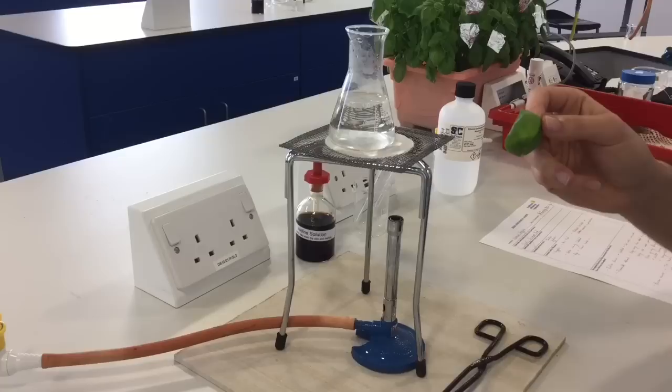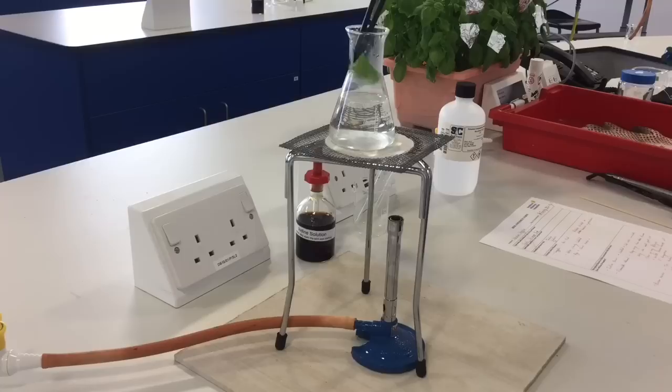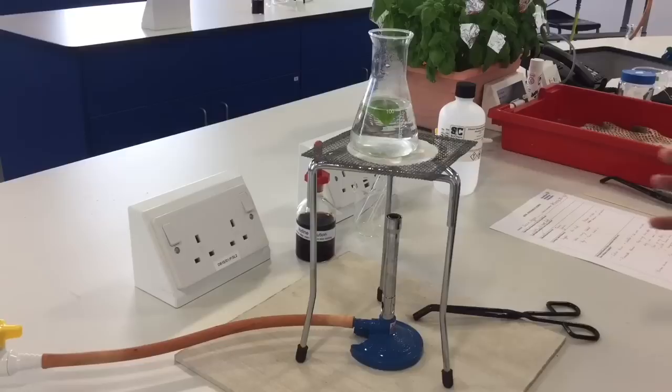What we're going to do is heat it in about 100 milliliters of water, just so it's completely submerged, for a few minutes to soften it up a little bit. Put your leaf into some water that we can then heat over the Bunsen burner for a couple of minutes.